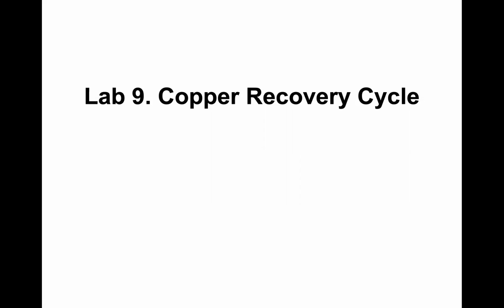Hi class. In this lab, we will do a copper recovery cycle. We will start with copper, and we will do a series of chemical reactions to convert it to a solution. And finally, we will regenerate the copper. In this case, we will test the law of conservation of mass.